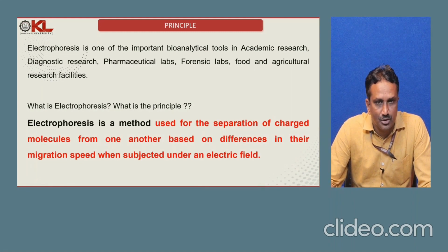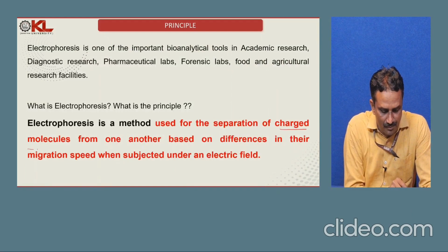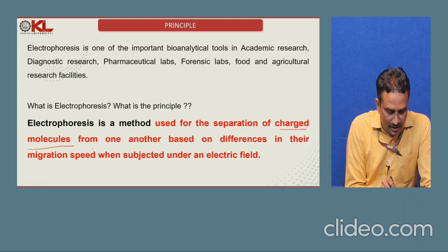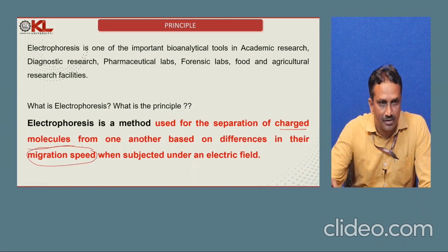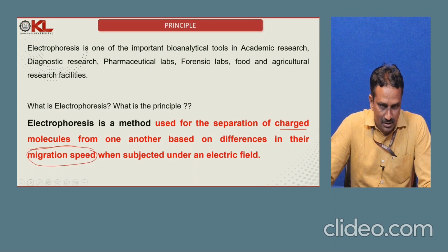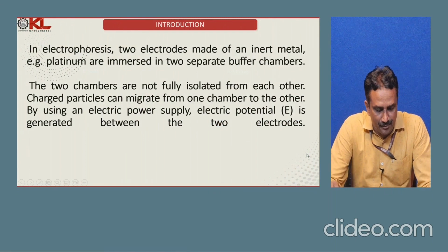Electrophoresis is a method used for the separation of charged molecules from one another based on differences in their migration when subjected to an electric field. Molecules which can be separated based on any physical property can be subjected to electrophoresis, based on their migration speed.